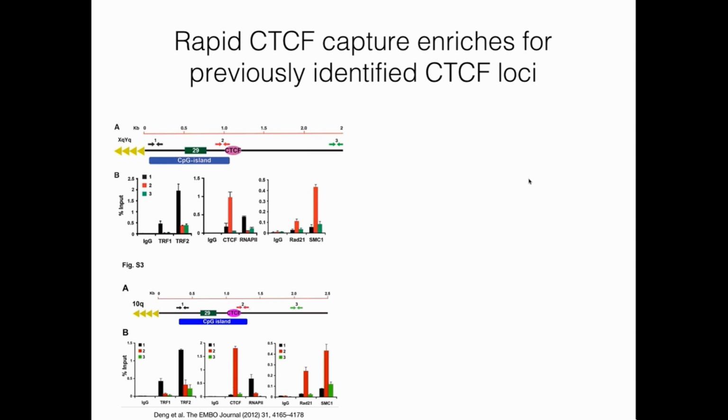They identified CTCF and cohesin complexes and their contribution to this protection. And they used 3 primer sets here, 1, 2, and 3 on the top, to detect CTCF binding on the telomeric region of 10Q and XQ.